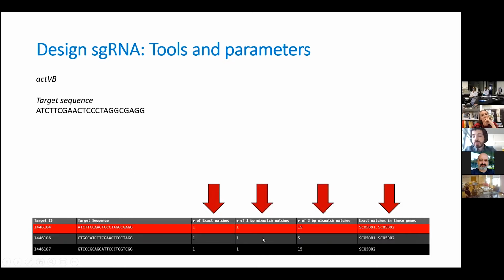It also tells you how many regions any sgRNA that you design based on this sequence is going to match. Basically what it tells you is that if there is one mismatch, meaning if somehow the Cas9 goes to a region that has just one nucleotide of difference, and of course this is unlikely but can happen, you know, biology is not perfect. If instead of having here an A, you have a T, it's not a perfect RNA-DNA interaction. So it is unlikely that Cas9 will bind there very efficiently, but it can still bind. It could still probably cut.